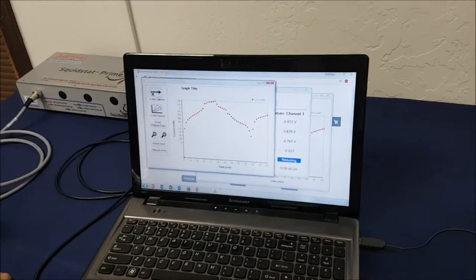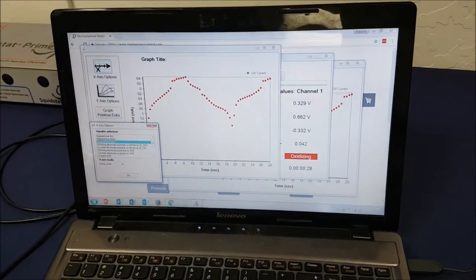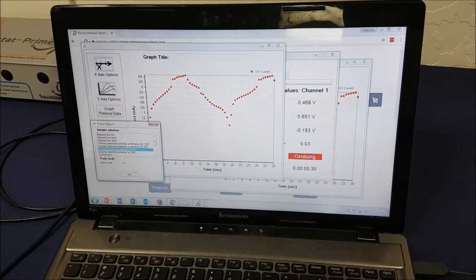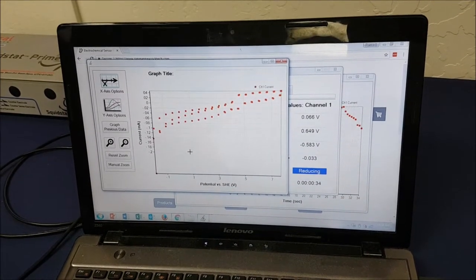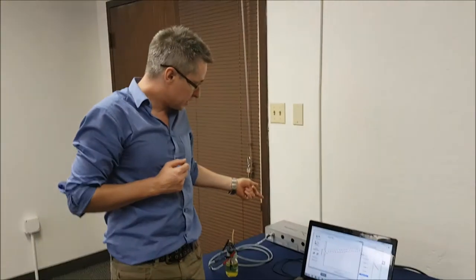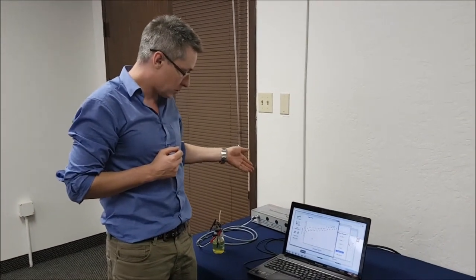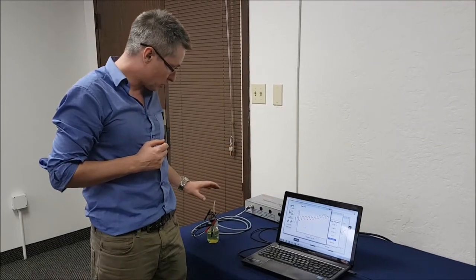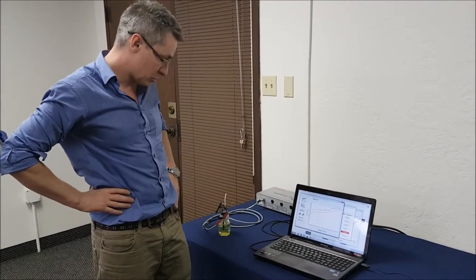I'm just going to change the axis on this one to working electrode versus time, and then I'm getting my CV at the moment. So I'm just going to do a quick summary and wrap up now. It can be up to a four-channel instrument. Each channel is a completely independent instrument. We were just doing a quick look at a ferrocyanide type solution.